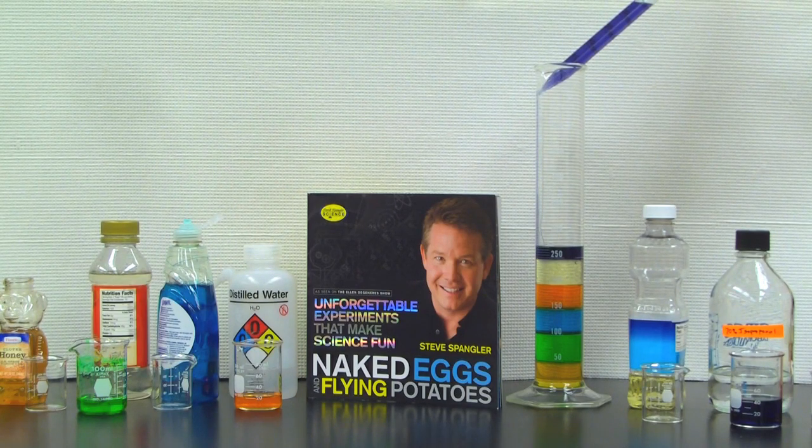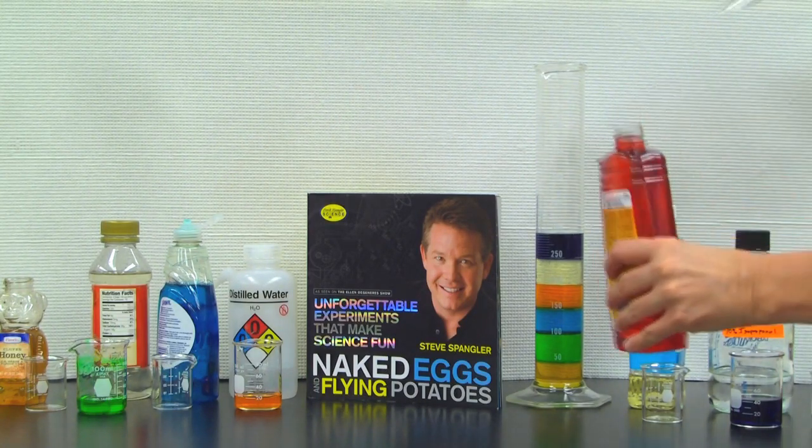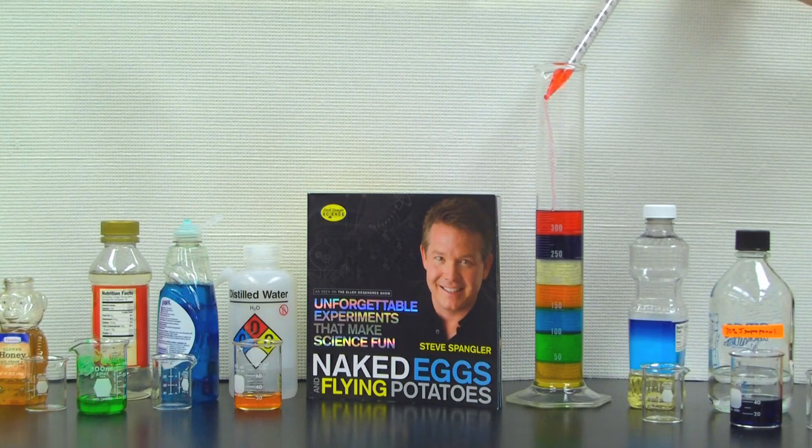Again, allow all the lighter substances to flow down the side of the cylinder that you've chosen to work with. I'm using 50 milliliters per substance here, but you can choose to make it more or less, whatever you have on hand. The final ingredient is paraffin oil, which is already colored red, that I bought from the store, and it has a specific gravity of 0.81 grams per centimeter cubed. As you can guess, our gummy bear is going to pretty much sink pretty far down into this density gradient column.